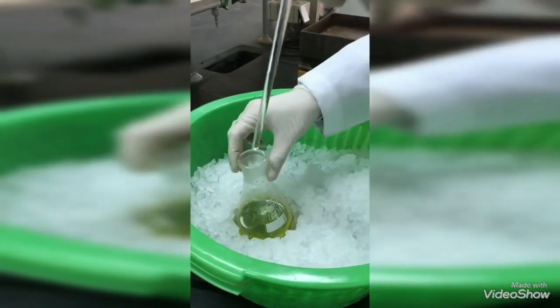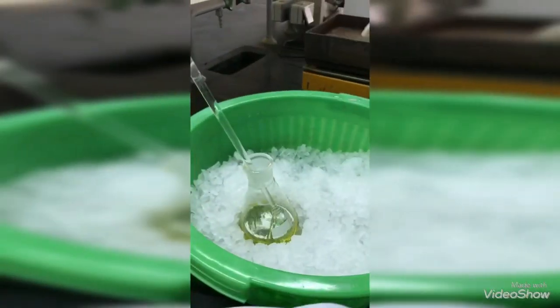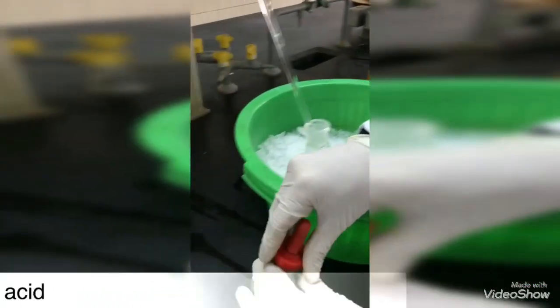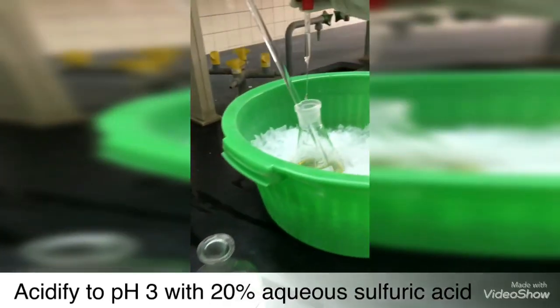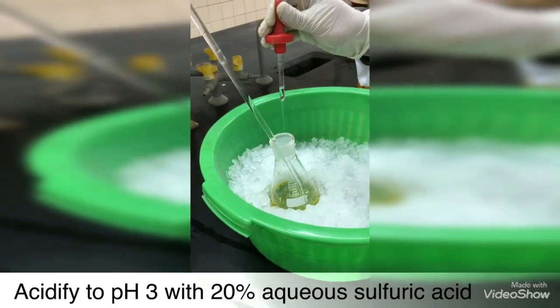Make sure that your filtrate is cold enough and start adding 20% aqueous H2SO4 to make the pH around 3.